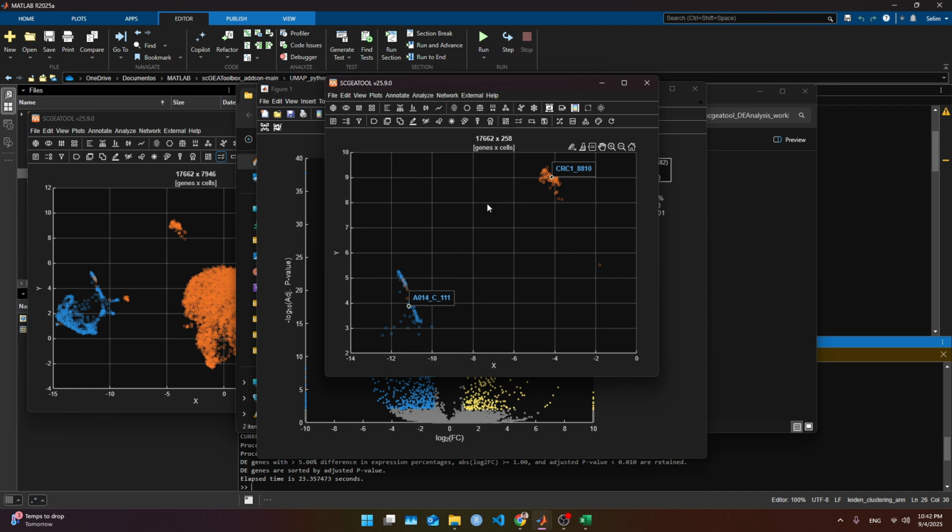It's gonna become even better. Probably that's why I got these RPL genes. We don't know until we curate and do this process a couple of times and verify that the integrity of the classification is proper. And for now, this is the differential expression downstream analysis, and I hope you catch something about it.